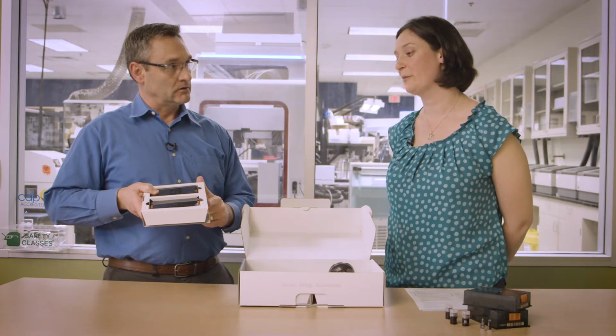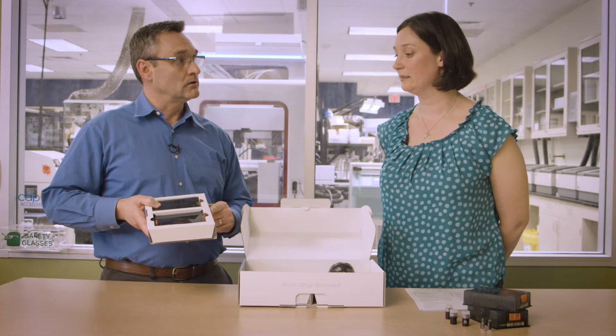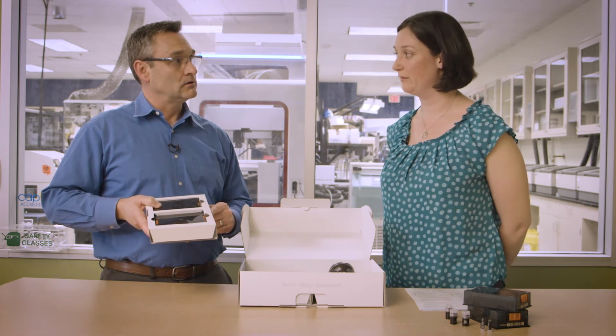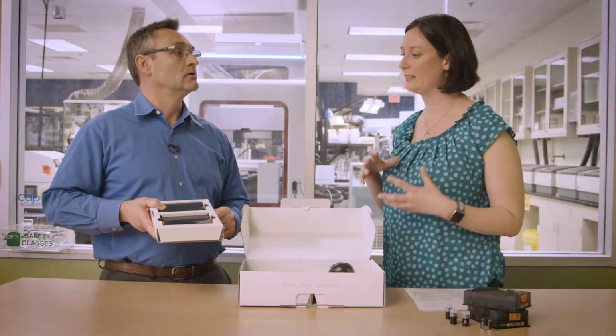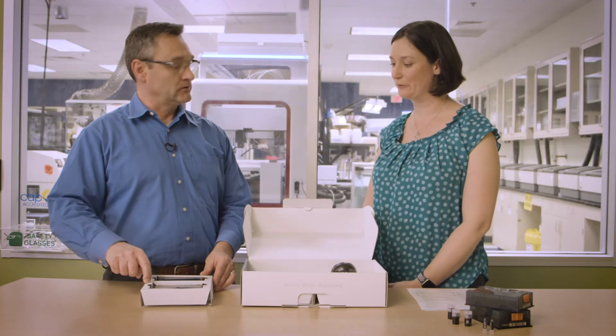Yes, the cradle is very important, and we ask that the client saves these because they will be used in the return shipment of the samples. They protect those racks and those samples when they are shipped back to us, and it keeps the racks intact. So don't throw these away. Don't throw them away. Keep those, right.